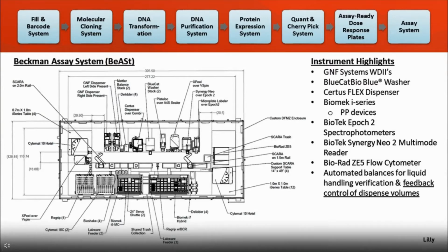You can see most of the systems I've discussed thus far are built around doing a fairly fixed workflow. This is the kind of jack of all trades where we're going to run everything from ELISAs to cell-based assays to high throughput flow assays. And it's large and it has a lot of equipment, but no screen incorporates all the equipment. You basically are looking at what you want to accomplish with a specific screen and applying the best tools for the job. And we have a lot of tools on this system to be able to accommodate any type of assays our scientists would like to run.